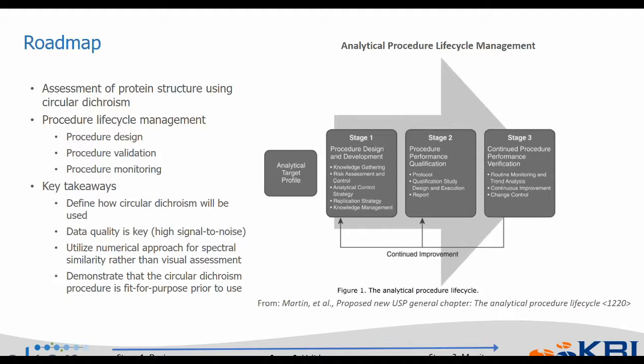The important point is that we need to be clear at the outset what the purpose of the method is. The second key point is around data quality, and I have a few slides demonstrating the importance of data quality, which can be reduced in many cases to achieving high signal to noise. I'll spend some time discussing the importance of having a numerical approach for spectral similarity rather than relying on visual assessment, which has traditionally been the approach that's used for spectroscopic methods. And finally, the goal of going through an analytical procedure lifecycle management process is to demonstrate that the procedure is fit for its intended purpose. And so I'll be discussing how we do that.